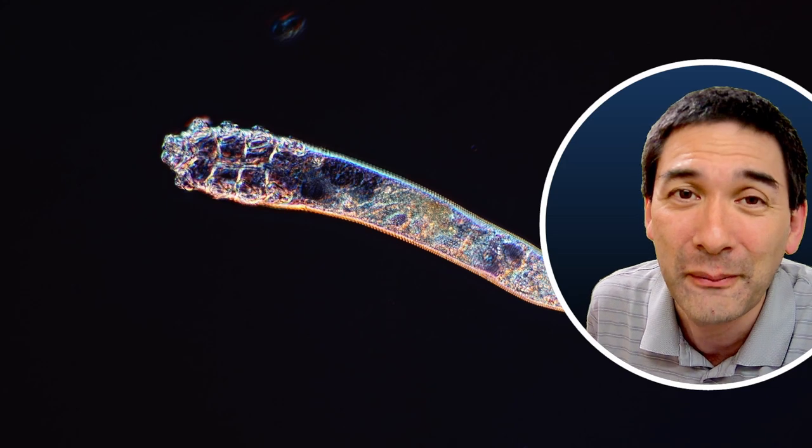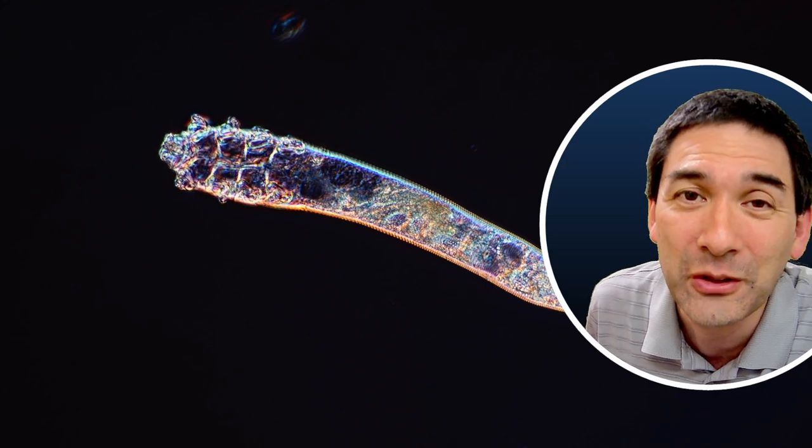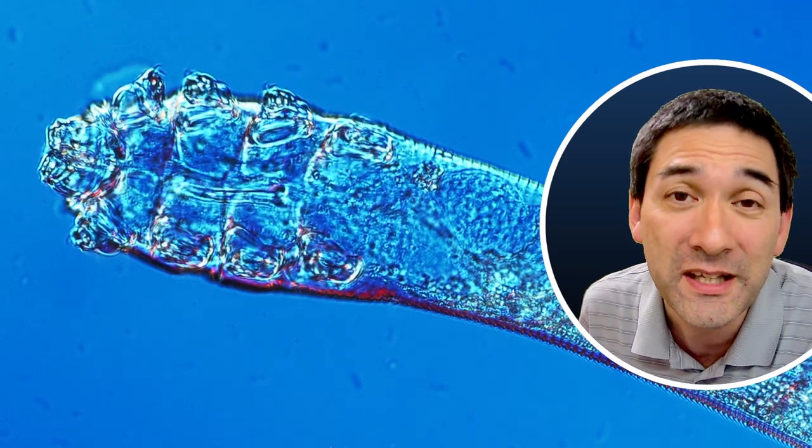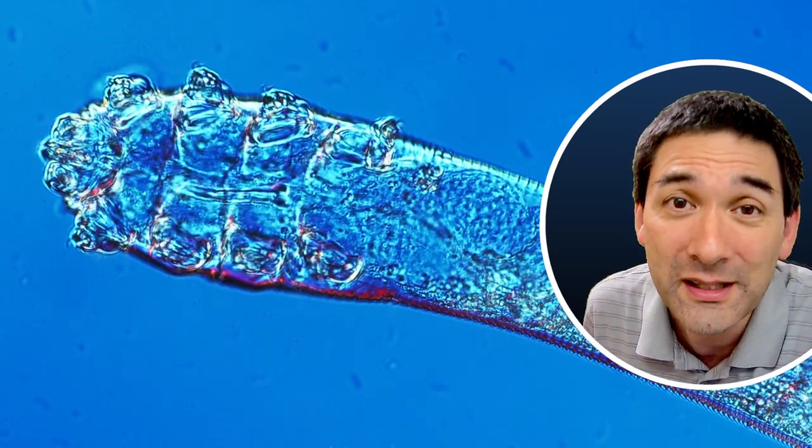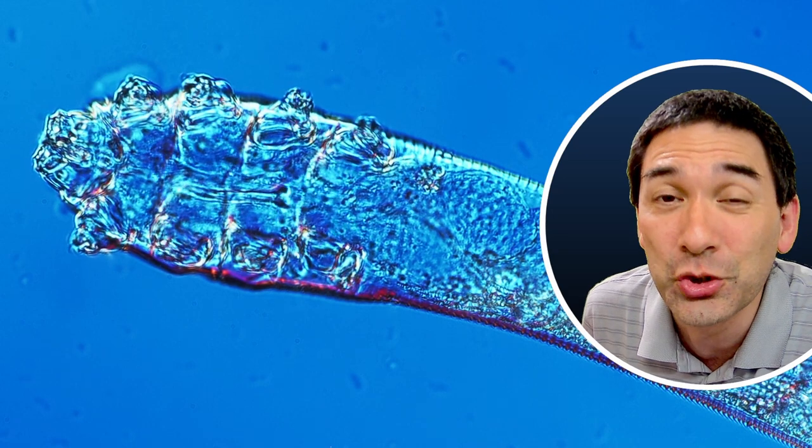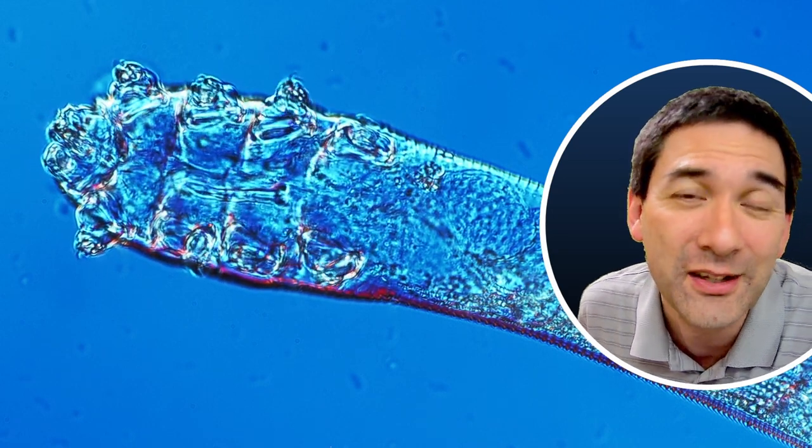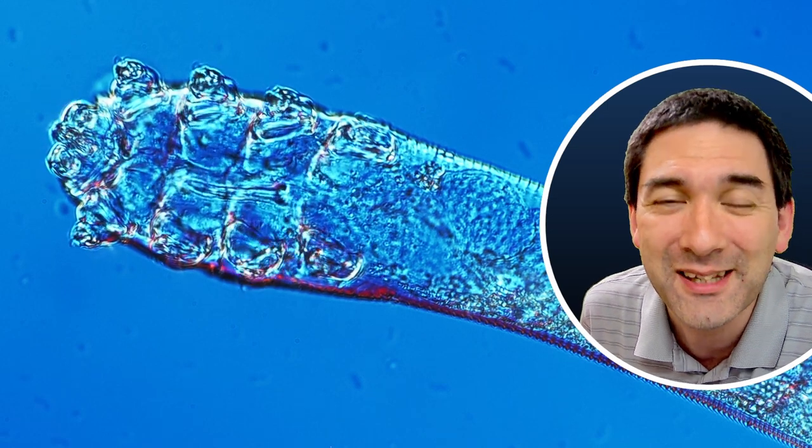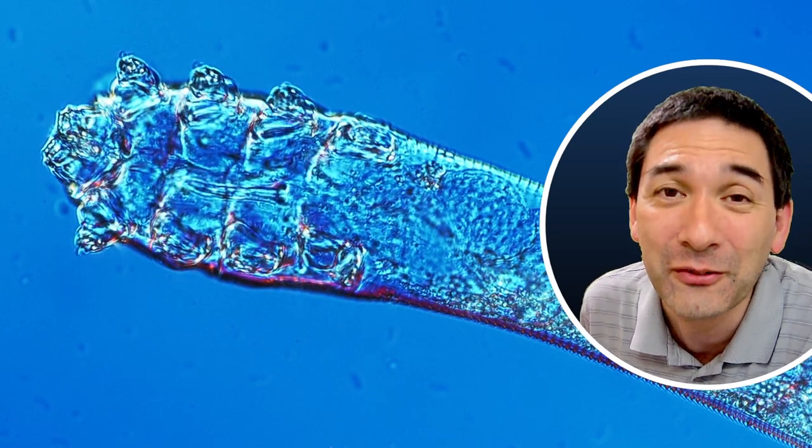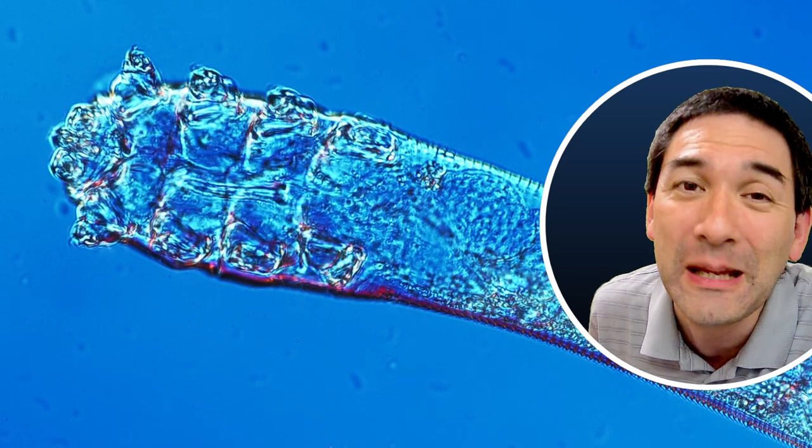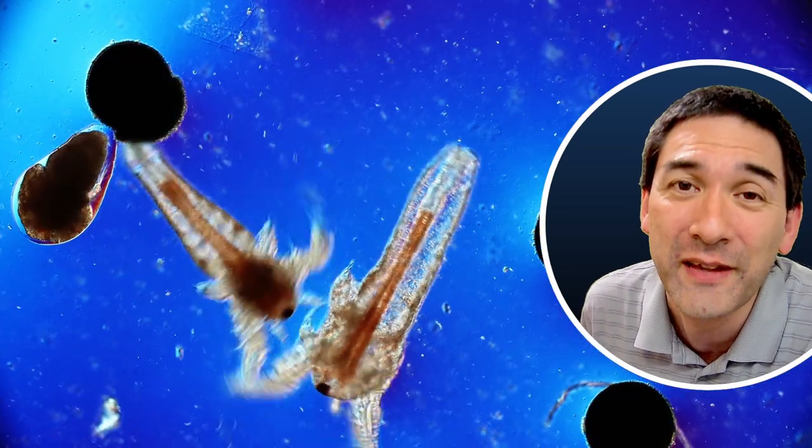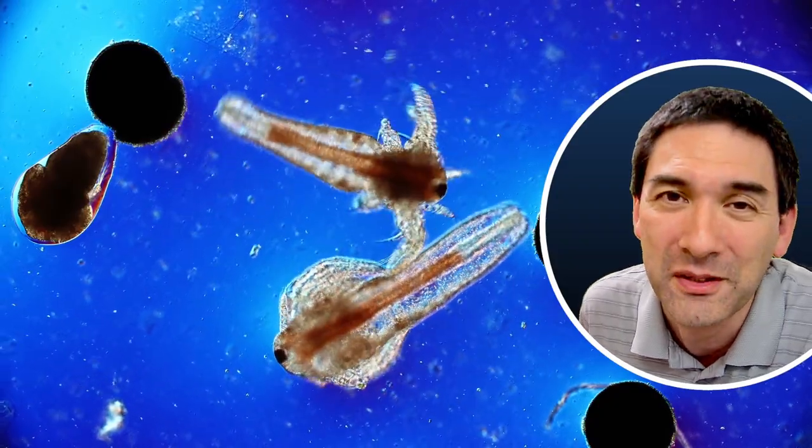I was lucky enough to find a few of them, and yeah, I really zoomed in quite a bit and you could actually also look into the face mite itself and into the organs. And a little bit of time-lapse also shows that the eight legs of the face mites are moving around. But in this case the face mite was compressed between the cover glass and the microscope slide, so it was inhibited in its movement. But I made a live stream on those face mites and I was quite happy to be successful here.